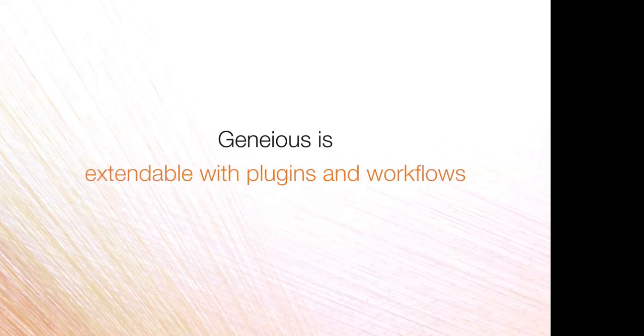And in addition to everything that's available within Geneious, there's also a wide variety of plugins available. These are everything from plugins written by our development team through to plugins that wrap well-known third-party tools. So when we're talking about alignment, there are tools like Clustal Omega and MAFFT. For tree building, there are things like FastTree and RAxML. For NGS, there are things like Flye, Minimap2 and SPAdes. They're all well-known, peer-reviewed tools, but they're available as plugins for Geneious.